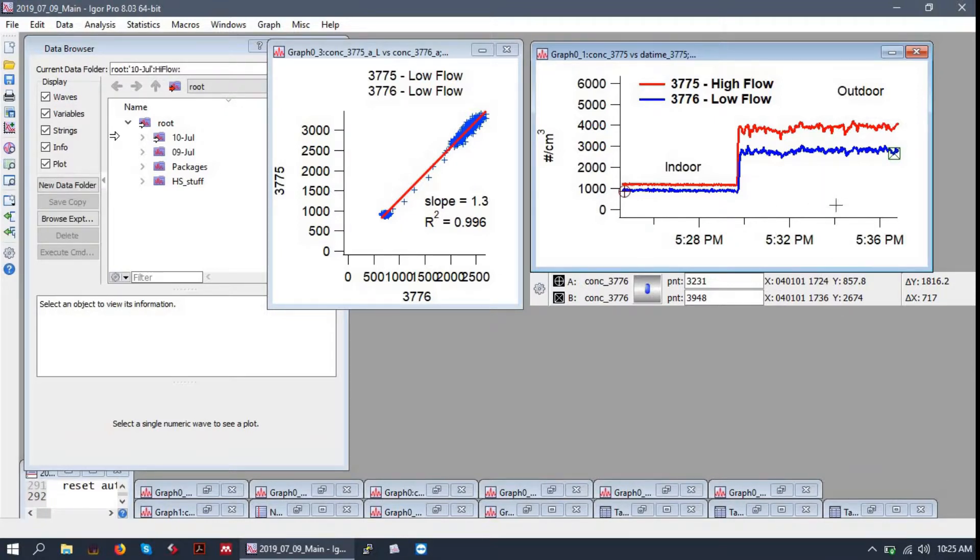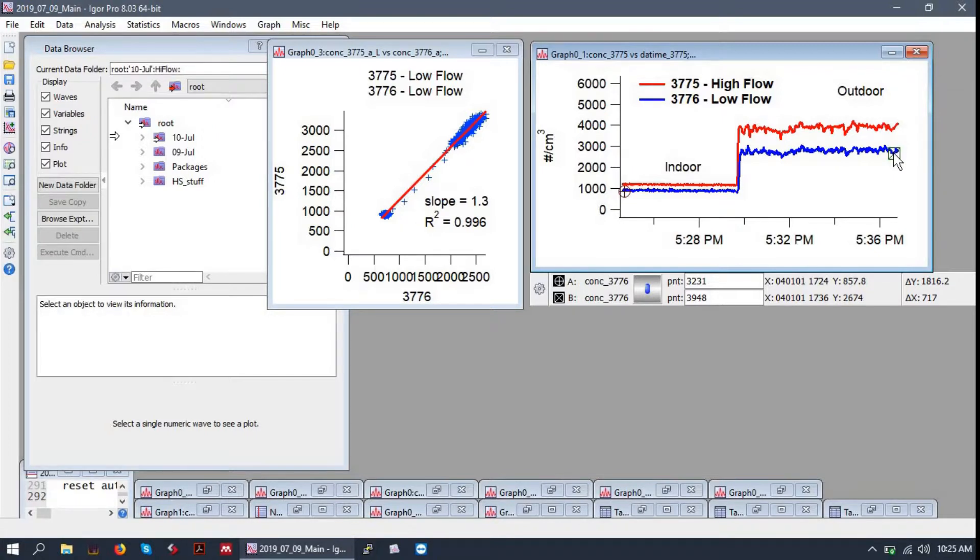Window management is pretty important in Igor, so try to keep things tidy. Otherwise, you will lose track of things, and it gets hairy very fast. So try to keep things organized.